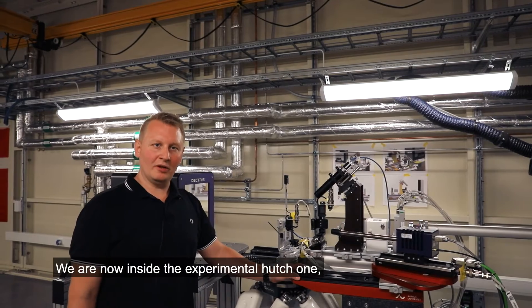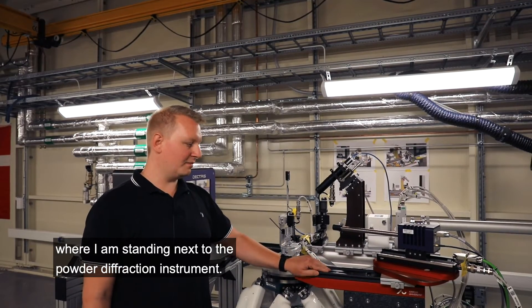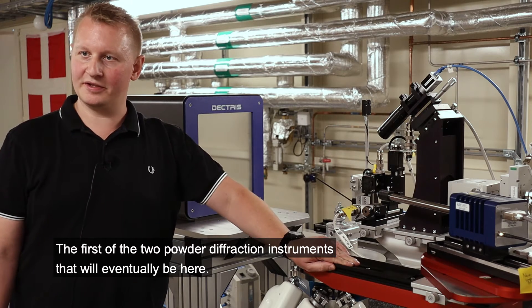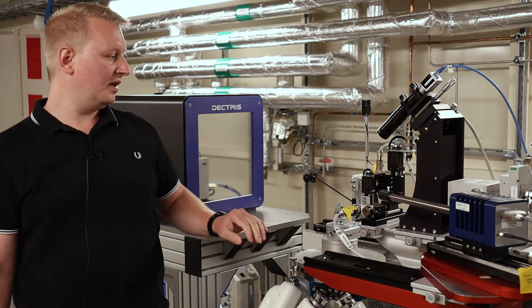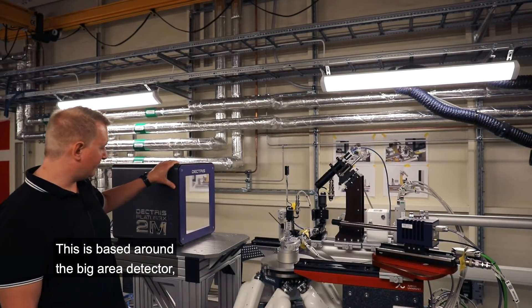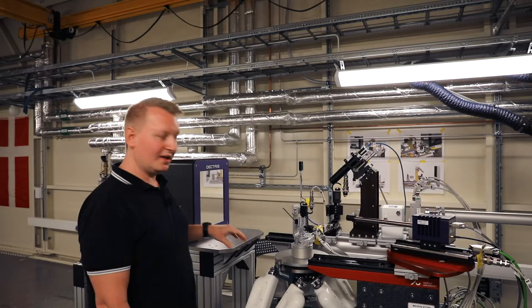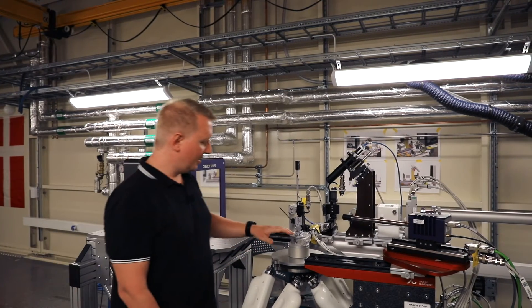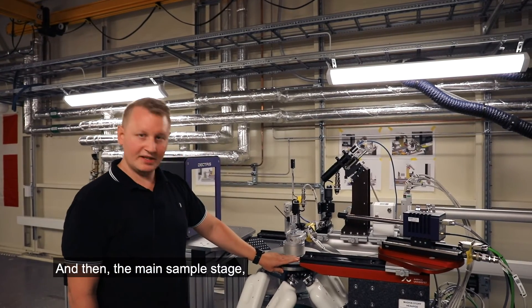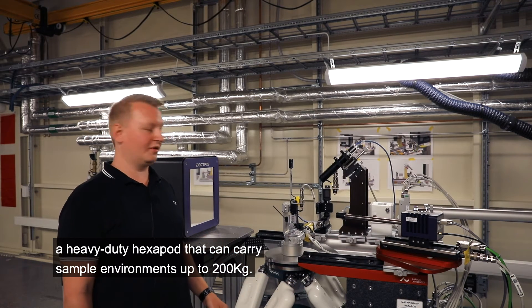We're now inside experimental hutch 1, where I'm standing next to the powder diffraction instrument — the first of the two powder diffraction instruments that will eventually be here. This is based around a big area detector, a Pilatus cadmium telluride for high energy that can do 250 Hz. And then the main sample stage, a heavy-duty hexapod that can carry sample environments up to 200 kilos.